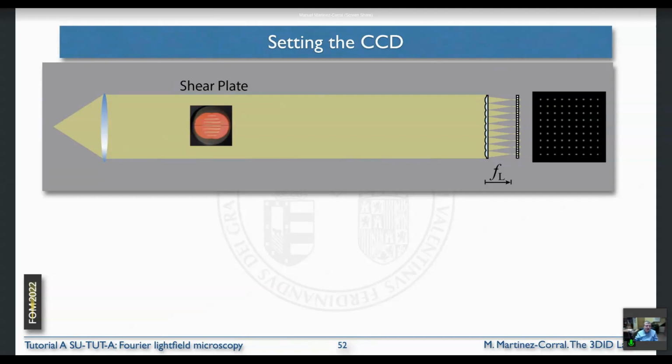So here we have a laser with a fiber, a collimating lens, and then we prepare a parallel beam. The optical axis of this parallel beam will be our optical axis. Then we prepare a parallel beam with a shear plate. We make sure that the parallel beam is really parallel. Sometimes there are other ways, with collimating systems or projecting onto a wall that is 10 meters away. Okay, let us suppose that you have a parallel beam.